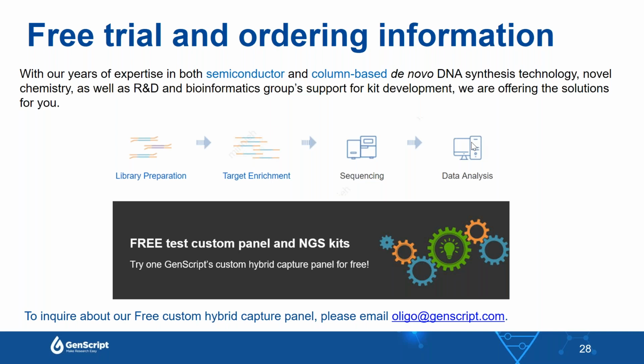Okay, thank you. And the sixth question is, how long does the GenFisher hybridization process take? Sure. The current protocol recommends a 16-hour hybridization, or you can just leave it overnight. There are detailed protocols available online, or you can just reach out to us and we will provide that to you. But I just want to make one more comment. We are launching a performance equivalent 1-hour hybridization protocol very soon.